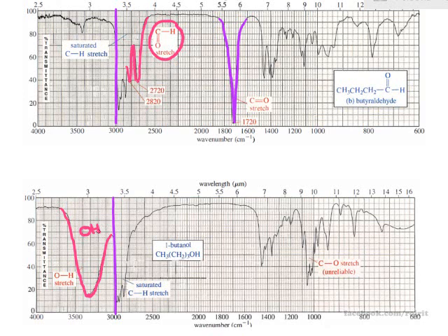Another thing you can use to confirm the presence of oxygen in the structure is the CO stretching. CO stretching appears at approximately 1000. But this is in the fingerprint region, and it's very hard to be sure of the presence of CO stretching here because of the complexity of the fingerprint region.